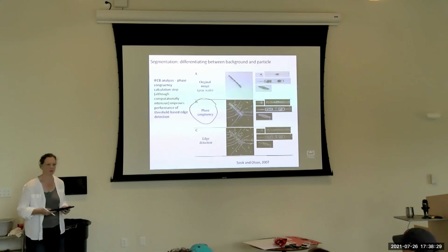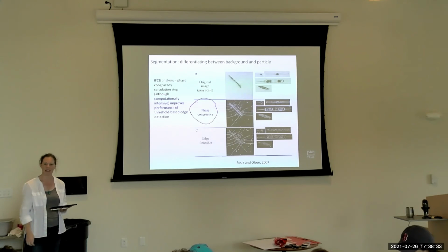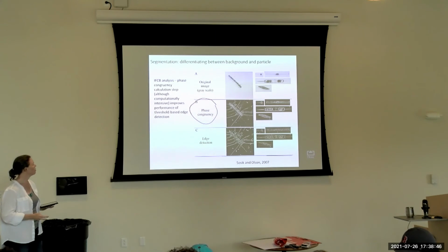So this is just from the Imaging FlowCytobot data. If you started applying this to other imaging sensors, I don't know if it would work as well or in the same way. So that's sort of another question. Does the same sequence of processing steps work across these different illumination and particle imaging platforms?